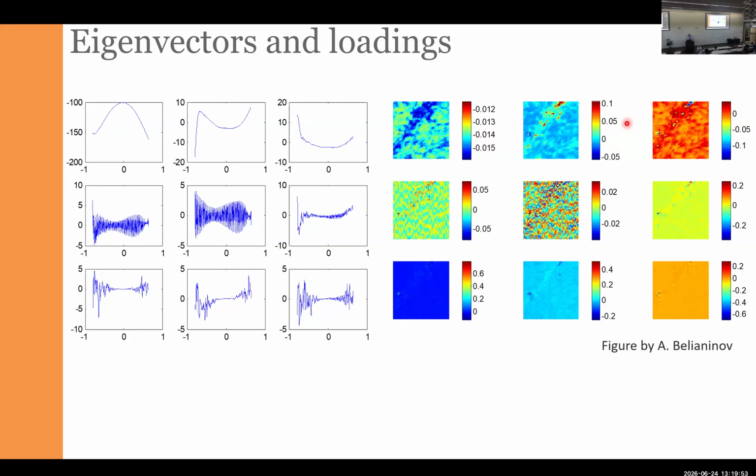All of a sudden, you start to see things. Some of these things are relevant to materials. You clearly start to see that there is some anomaly in this image. Some of these components look like noise. They look like noise here, and they look like noise here. It turns out that PCA has this wonderful capability that if you have something like 60-cycle noise coming from the electric plugs and so on, it will generally filter it out into two components, and they would be orthonormal.